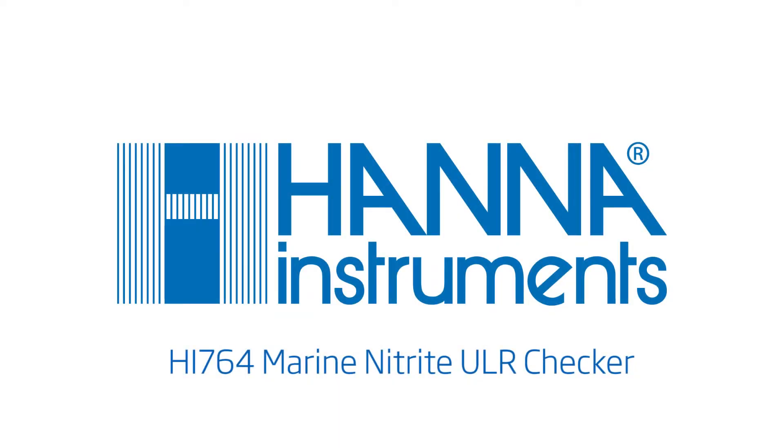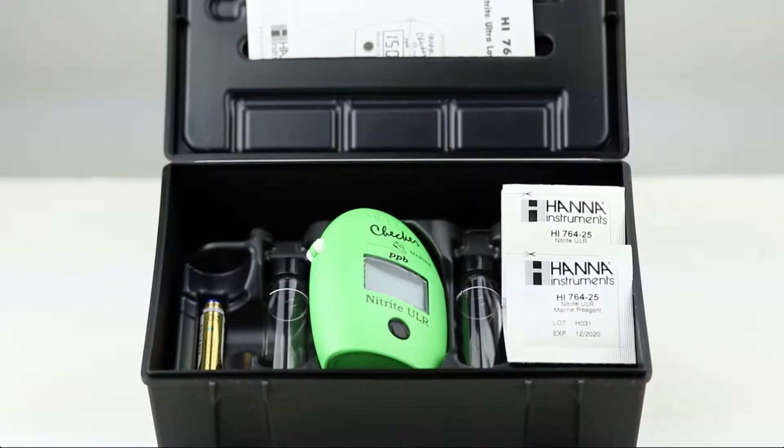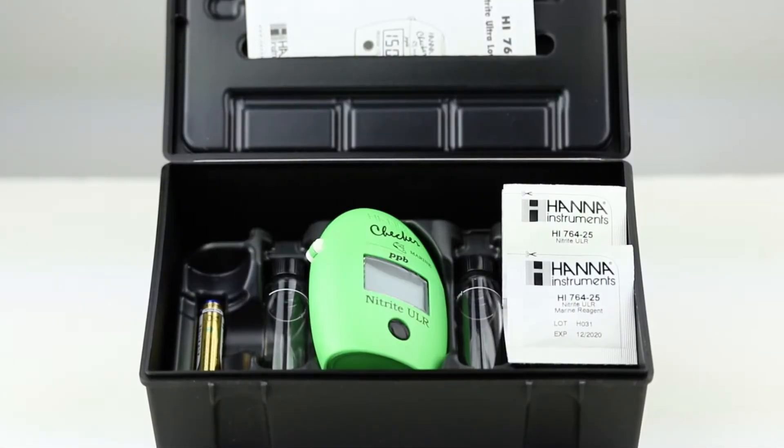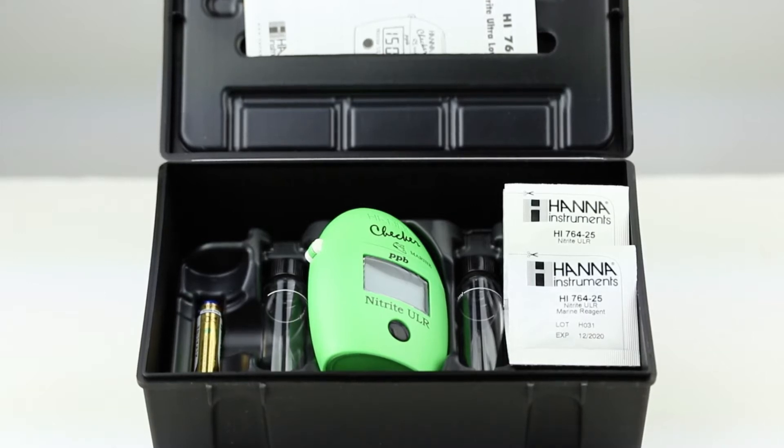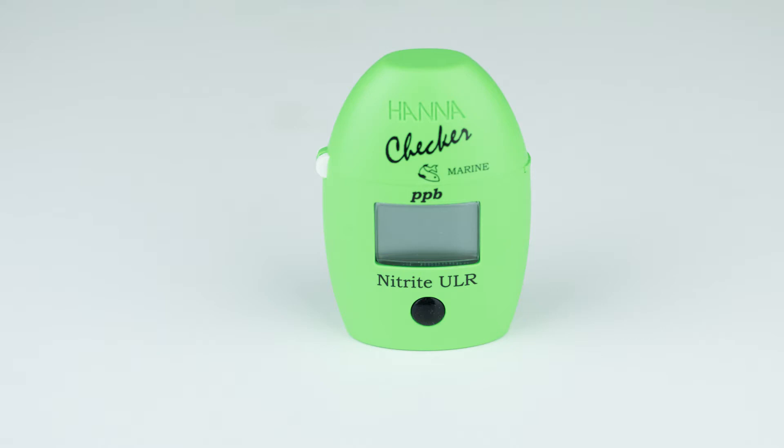The Hanna Instruments HI-764 Marine Nitrite Ultra Low Range Checker is a compact and portable meter that bridges the gap between simple chemical test kits and professional instrumentation. The one-button design allows users to operate the meter with ease. Today we will go over the proper use of the HI-764.